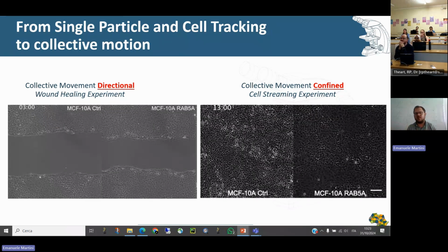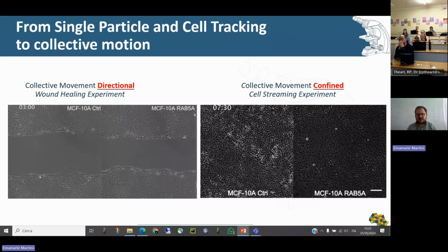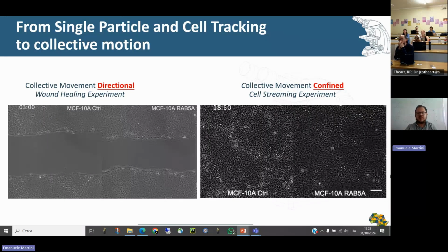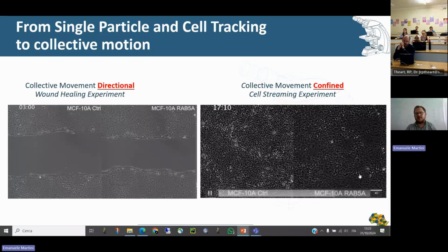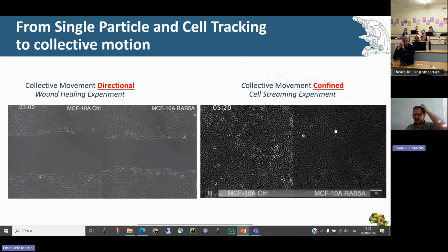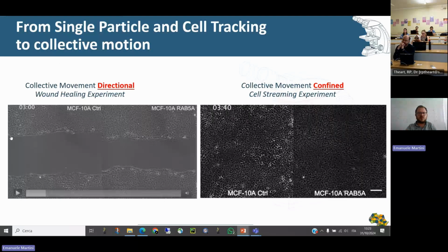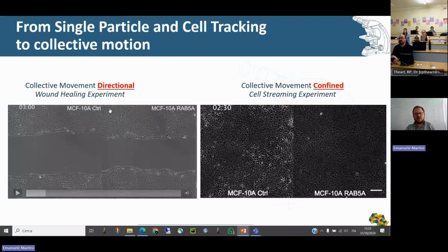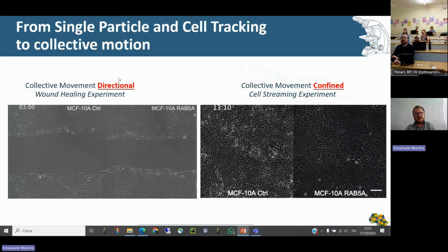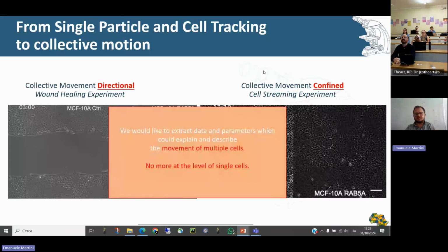In the next slides, we will explore this kind of experiment in a theoretical way, because it's harder to do hands-on in 1 hour. Instead, we will do a Fiji analysis of the other one by hand, in 30-40 minutes.